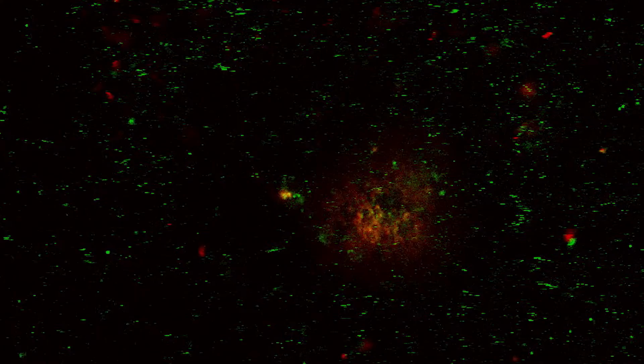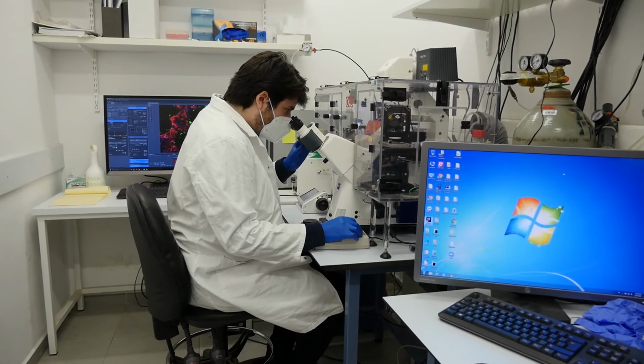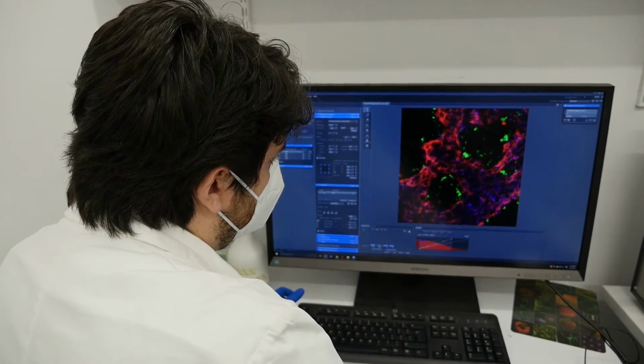Over the past 2 years, we developed a three-dimensional model of the human kidney. There are many instances where prescription medication or chemotherapeutic agent actually causes damage to the kidney. One of the most important ones is cisplatin. Cisplatin is a routinely used chemotherapeutic agent that is used in a variety of cancers. But we usually limit its use to 5 or 7 days treatment because of the kidney damage.